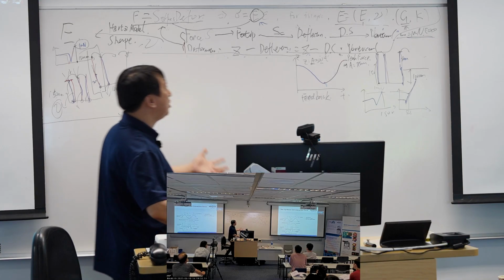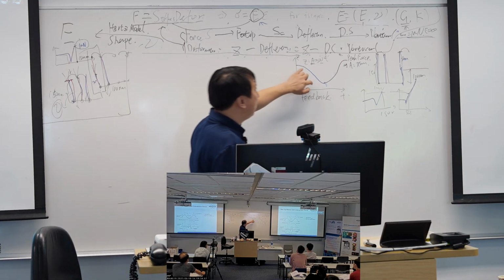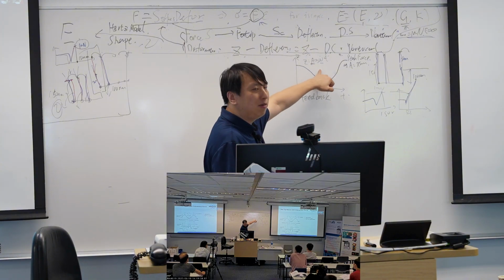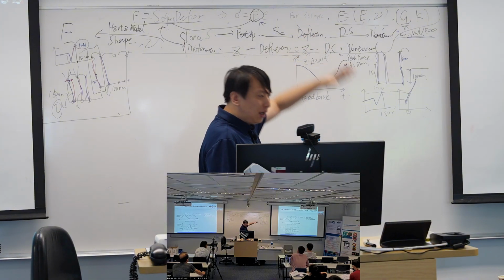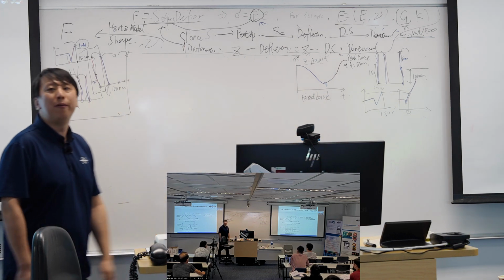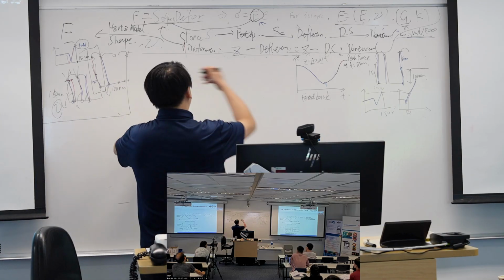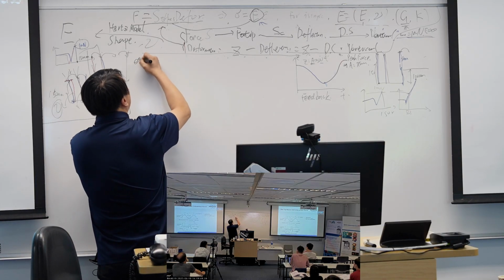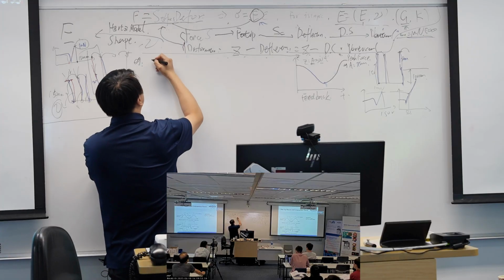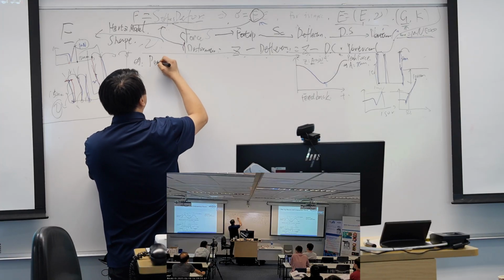As such, once it travels this amplitude, once it travels down 150, I still touch the surface. I reach the 1 nanonewton. So my setup is this. I still give a setup, but this time the setup is peak force.